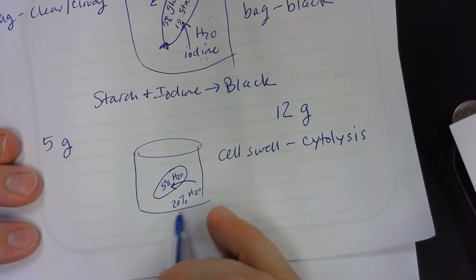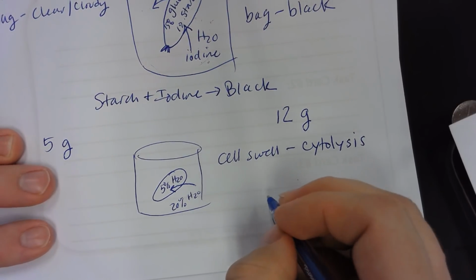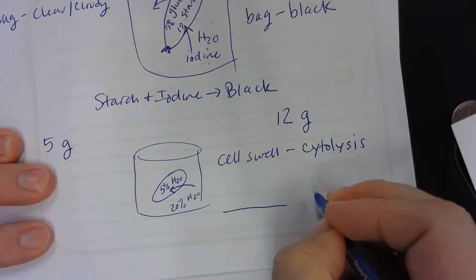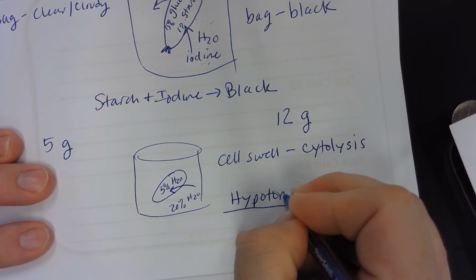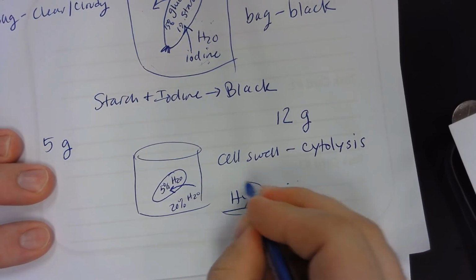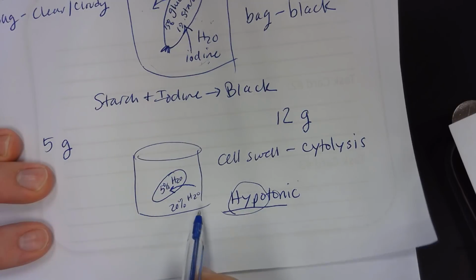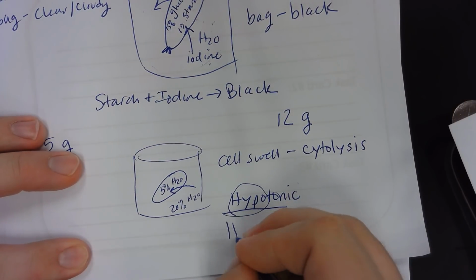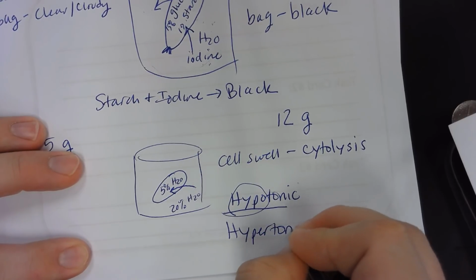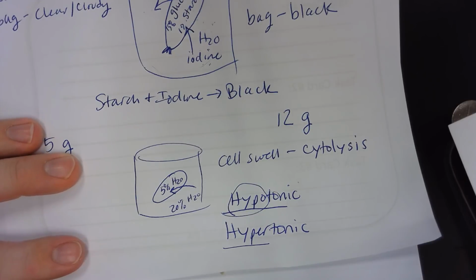This process where water is more concentrated on the outside than the inside is called what kind of solution? That's right, it is called hypotonic. Remember the word hippo: hippos are big and fat and take in water. Water is moving into the cell. The opposite of hypotonic, of course, is hypertonic, where the water would have been moving out of the cell, but we don't have that situation.